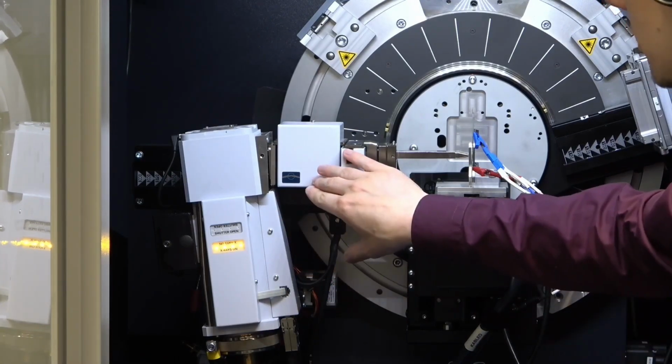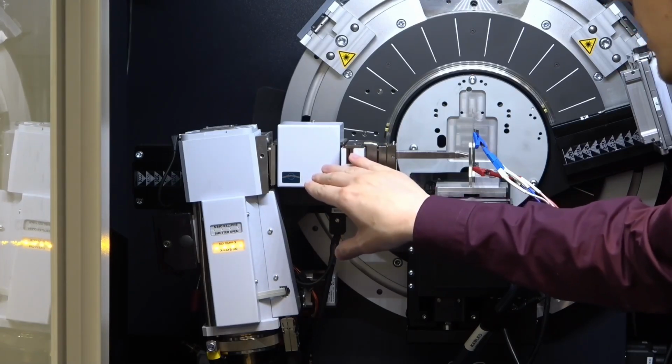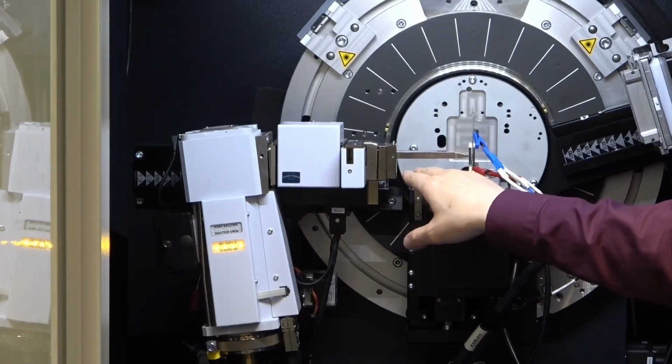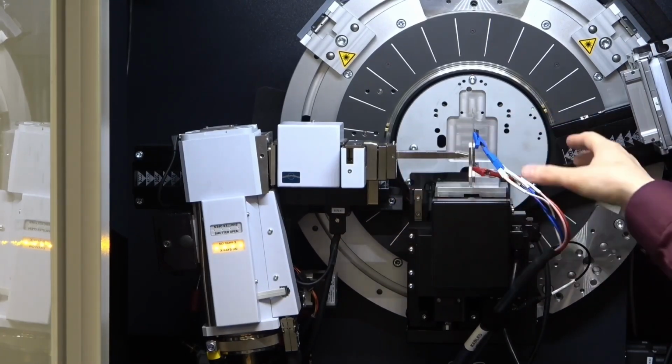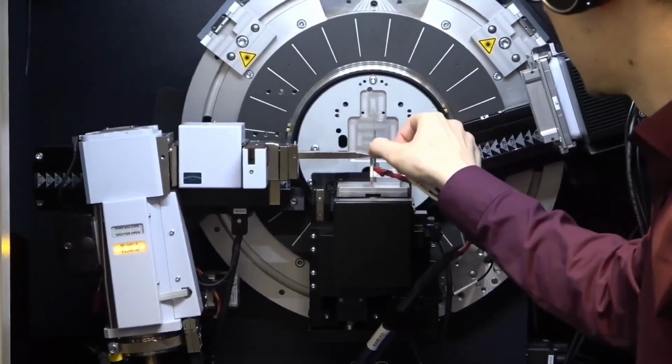I'm using a focusing Göbel mirror as an optic, which will allow us to gain even more flux and a very high resolution. It's focusing towards the detector. I'm using some scatter protection in front of a pouch cell. Here I'm using a single layer pouch cell, NMC, that's briefly disconnected to have a look.